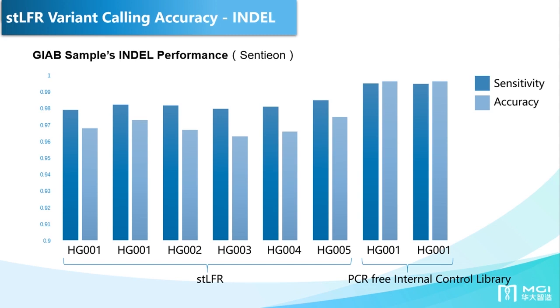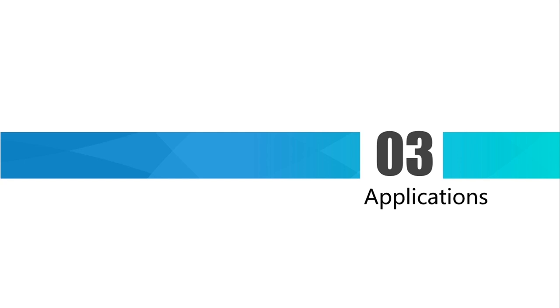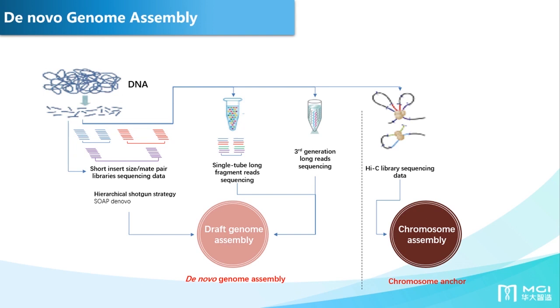Okay, next we will talk a little bit about the applications for this type of long read technology. Obviously, when we have much longer reads, this can definitely help with de novo genome assembly. Traditionally we use so-called third generation long reads, but now you can use second generation short reads to achieve this long read information in a much more cost-effective manner.